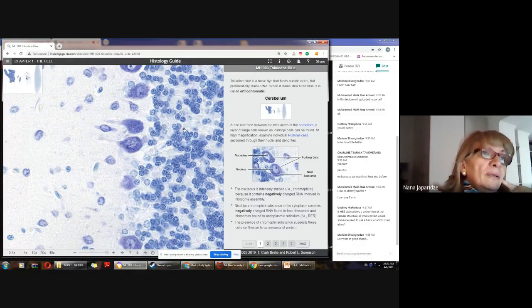But you know, this type of staining, I mean acidophilic and basophilic staining, have some minuses, of course. For example, in the case of nerve cells, when we want to see the whole shape of a neuron, we have to use silver staining.